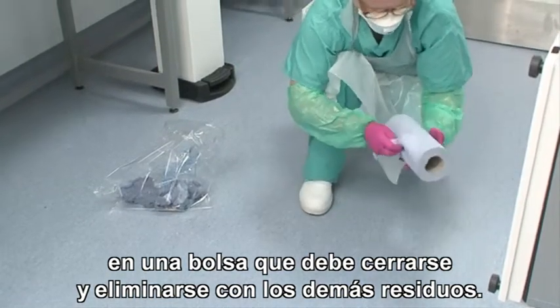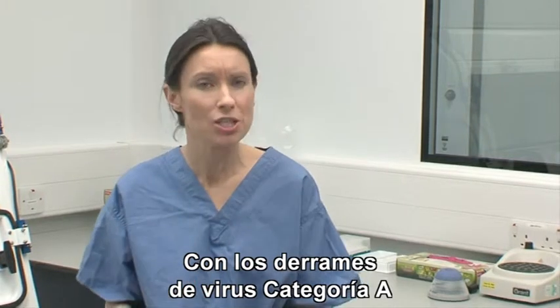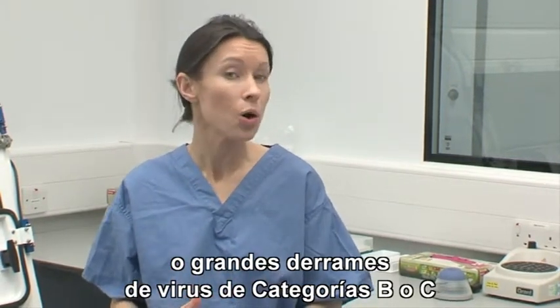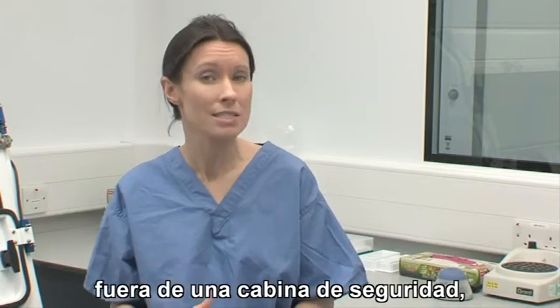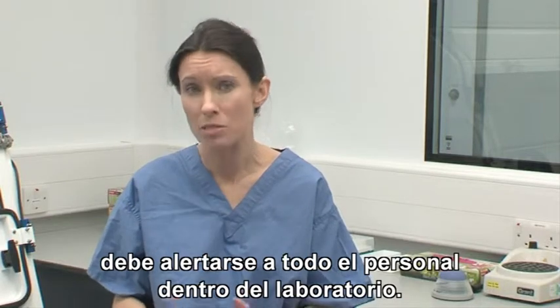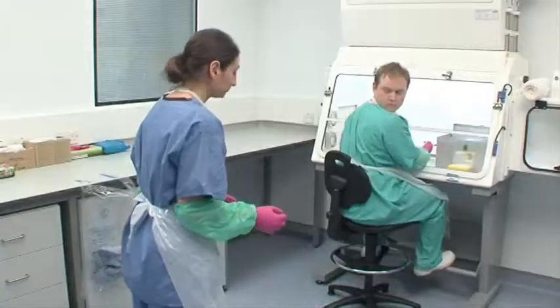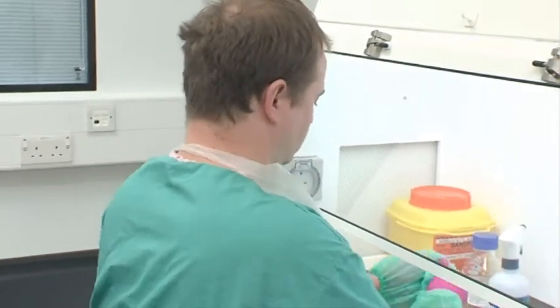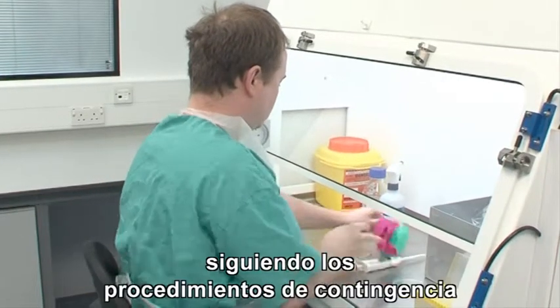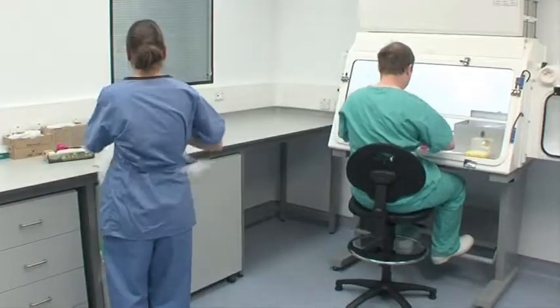With any spill involving Category A viruses or a large spill involving a Category B or C virus outside a safety cabinet, all personnel within the laboratory must be notified. All staff must vacate the facility immediately, according to the contingency procedures detailed in the risk assessment.